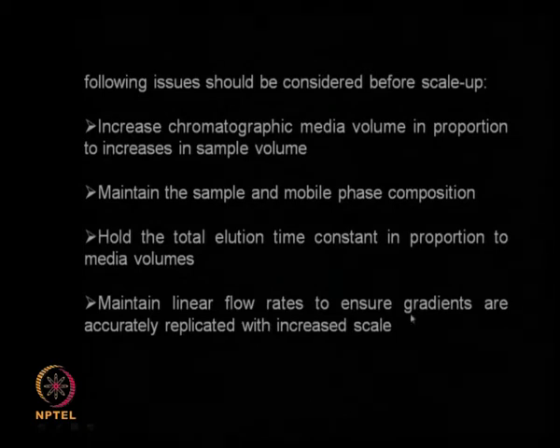I want to maintain linear flow rates so that gradients are accurately replicated with the increased scale. When I am doing a gradient or a mixture of solvent flow rates in small scale, I want to replicate the same thing in the large scale so that there is no discrepancy when I scale it up from small to large scale.